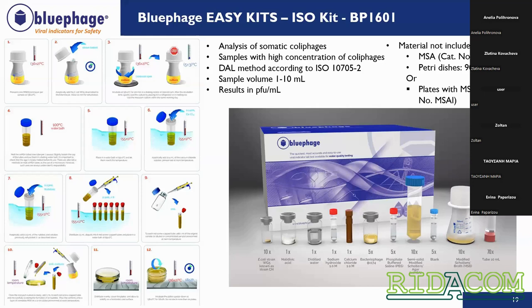So it has all the material that you need to perform the analysis except one material. The ISO methodology is a double agar layer methodology, so you need to perform two layers of MSA. The first layer of MSA is the one that is not included in the kit. So you have two options. You can buy the 90 millimeter Petri dishes as well as the MSA powder, or also the 90 millimeter plates with one layer of MSA. Once you have that, plus the kit 1601, you have all the materials required to perform the analysis.